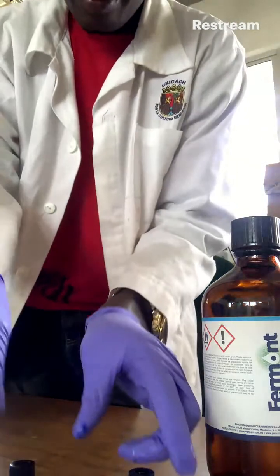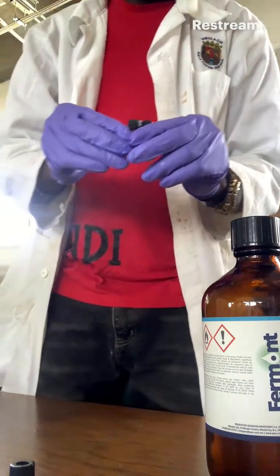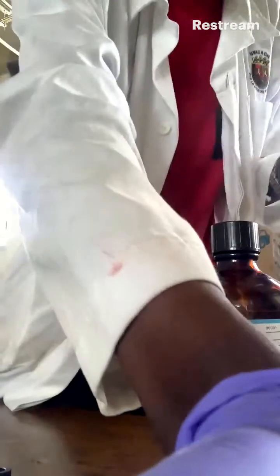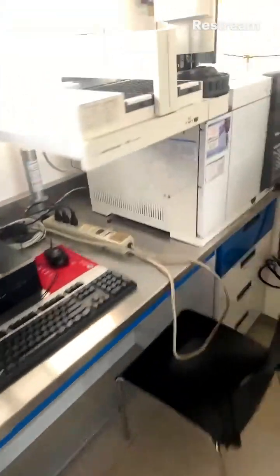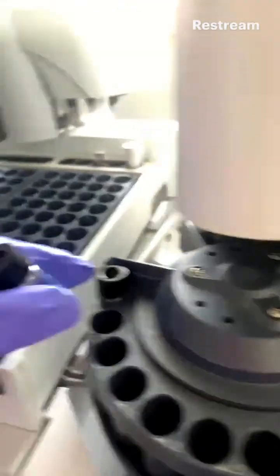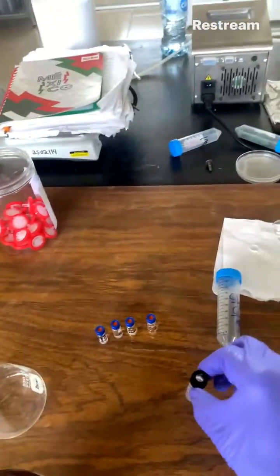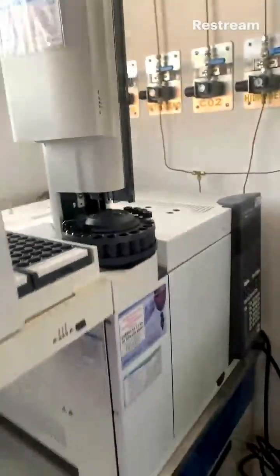So I'm taking my wash to the machine, and I will put them in position 1, position 2, and position 3.